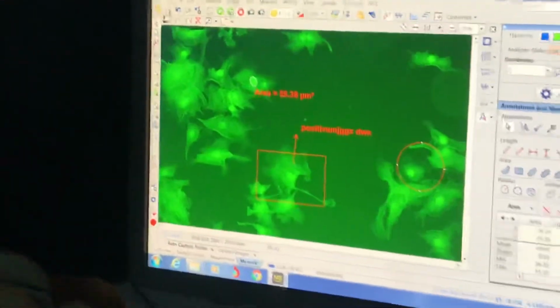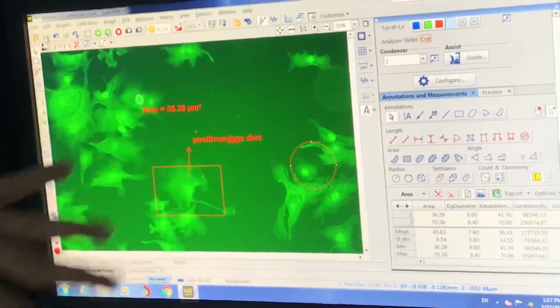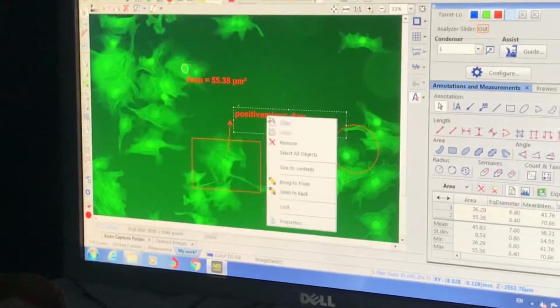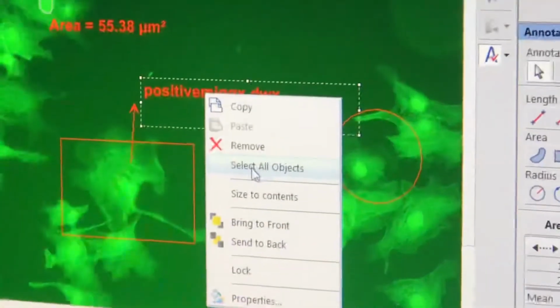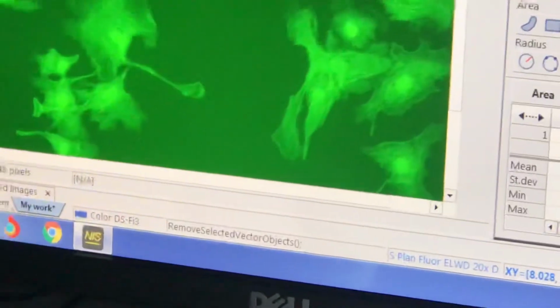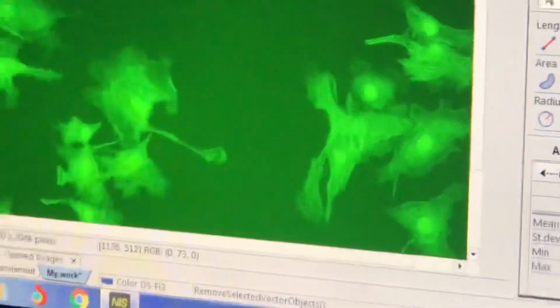But sometimes maybe you want the same image without these things. So it's better, also, after doing it, if you open here, you can remove it by right click, Remove, select all, Remove. Or you can remove one by one. Maybe by mistake we were trying to measure length and you can find more than one.